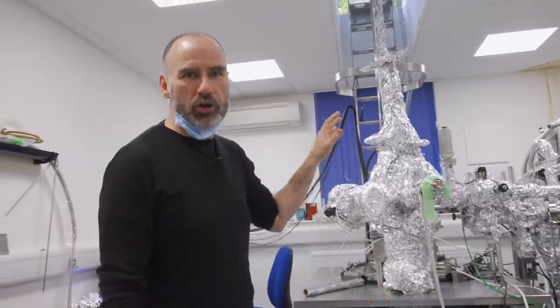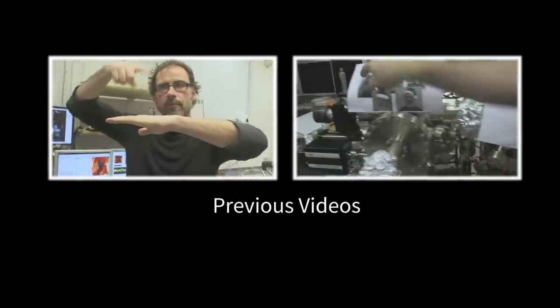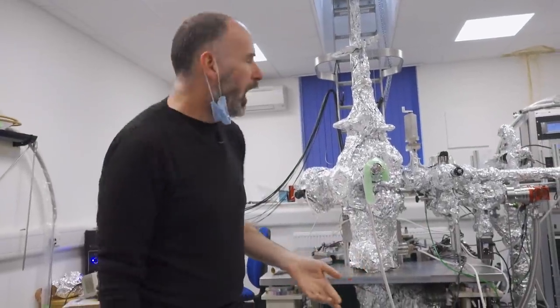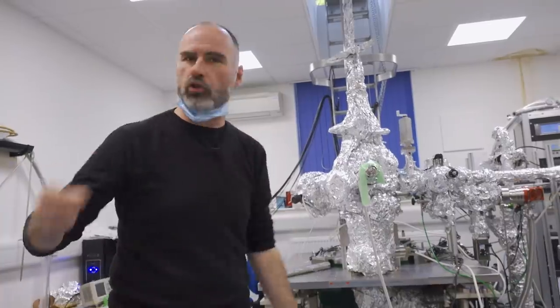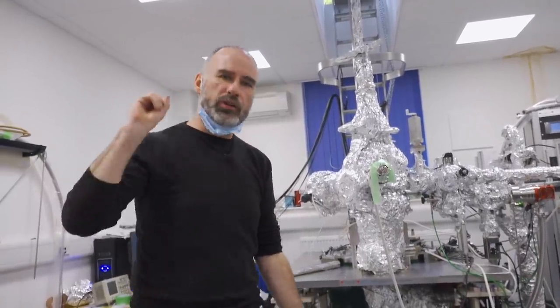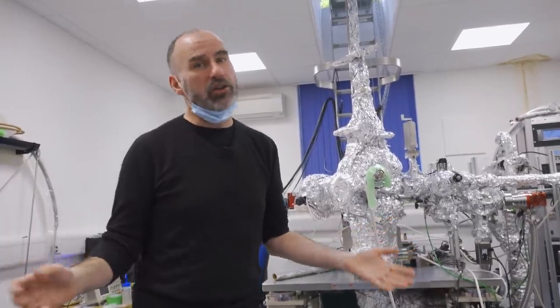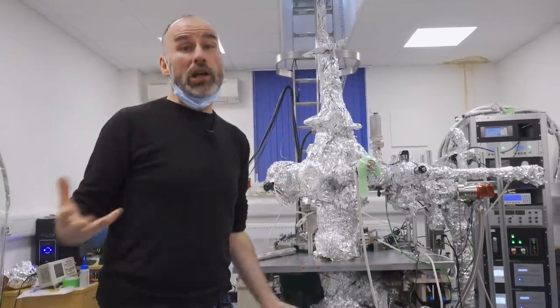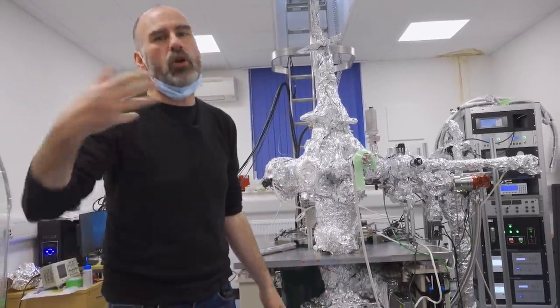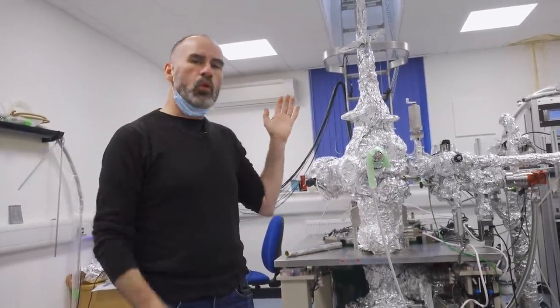Ultimately, we want to get to what's called an ultra high vacuum in here. I've talked about this in other Sixty Symbols videos at length. But what we're doing is we're heating up the system, and the tin foil's there just to keep everything nice and toasty. The key contaminant, if we don't do this, is water. The internal surface is all covered with a very thin film of water, and if we don't heat and pump, that water just stays there for months, if not years, and leaks off the walls gradually and pollutes our vacuum. What we're doing now is boiling off the water, accelerating the process, pumping it all away, so when everything cools down, after about a week, we'll get a much better vacuum.